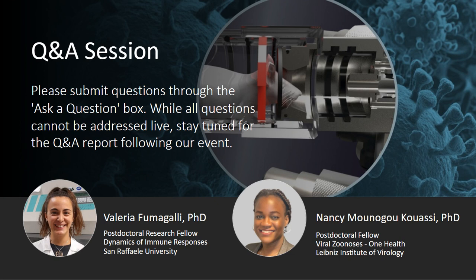Oh yeah, this is also a very great question. For us, during the infection with SARS-CoV-2 in male hamsters, we could see by eye this increased breathing frequency. It was really nice that what we saw by eye, we could also confirm with the whole body measurement. We measured a lot of hamsters, male and female, and we could confirm this in each experiment. For the whole body plethysmography, the tidal volume and the frequency were really important, and also the EF50, the mid-tidal flow. On the other hand, in the future it will be nice to have, for example, the resistance and the compliance measured directly in the hamster.